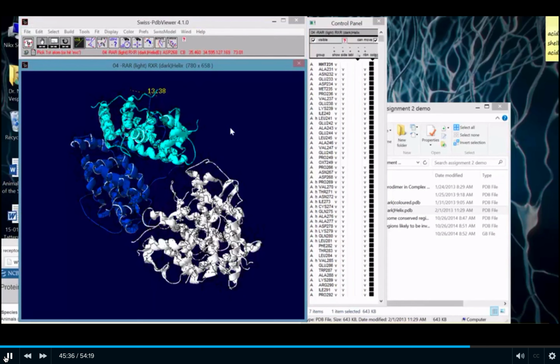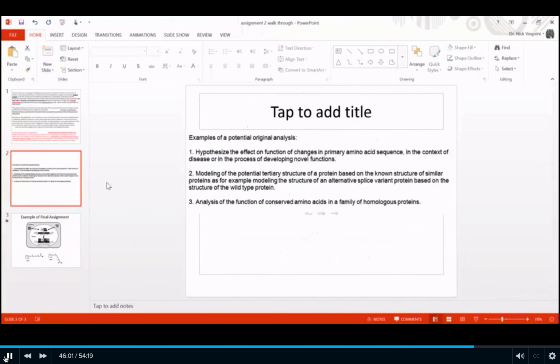I'm going to change a protein. I'm going to make this mutation. In my case here, I'm making a stringent protein more promiscuous, or vice versa, a promiscuous protein more stringent. And I'm going to prove that, one, by showing the physical overlay between my ligand and the protein. And then secondly, whatever structural change I've done, I'm either going to prove with folding or prove with something else. And that's really about it. Really sort of long-winded, but that covers all of part one.